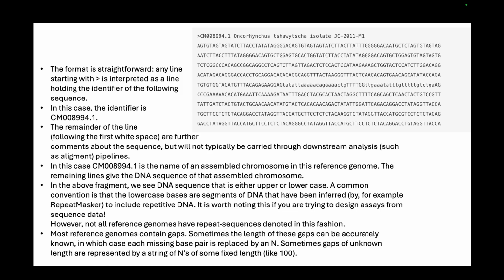If you completely want to remove that sequence from your FASTA file or whatever, you can just replace those particular stretches of DNA with N, right? So there will be ATGC, and N will mark the missing portions. In cases of gaps, or in case you want to do hard masking, this is called soft masking, converting from capital to small letters. But if you want to do hard masking and remove certain portions of the genome, you can just use N, right?